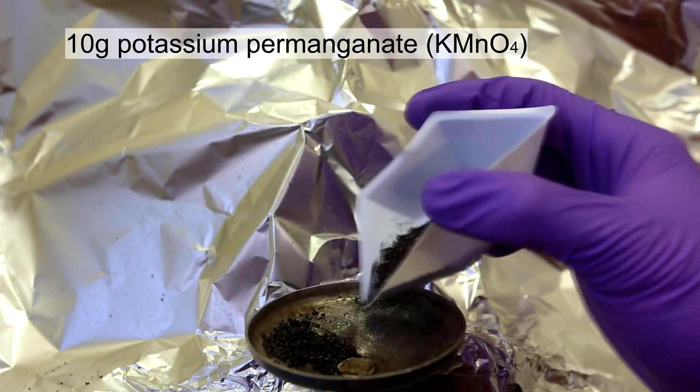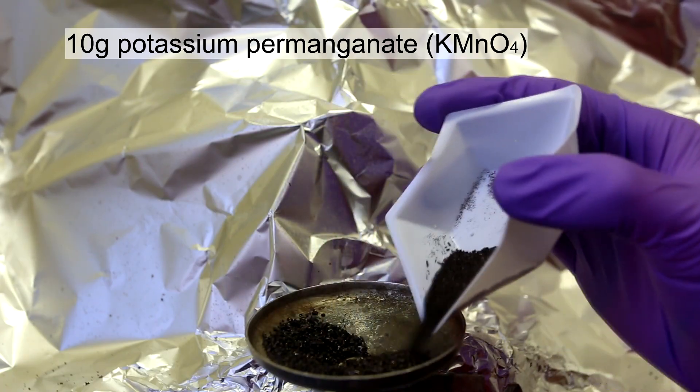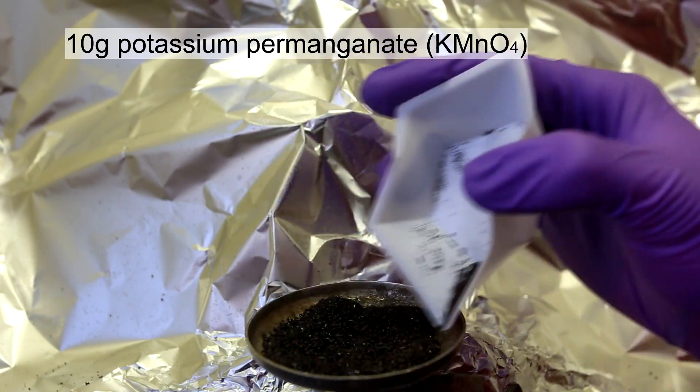First, about 10 grams of potassium permanganate was added to a suitable dish. Crystalline potassium permanganate was used.